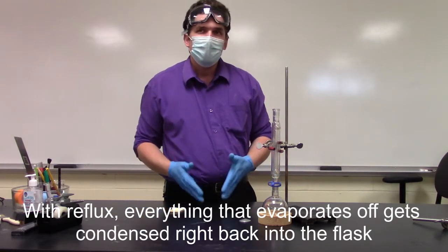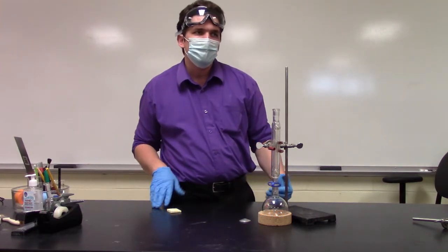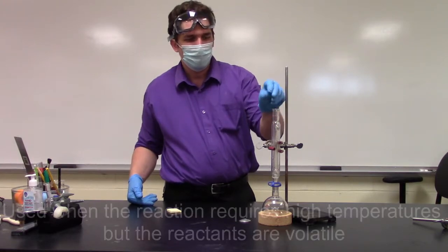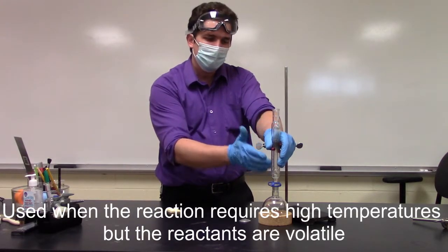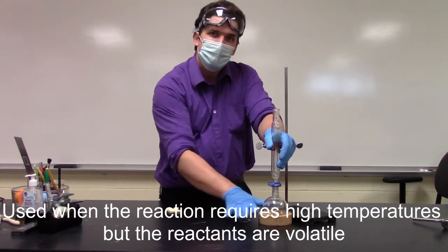So what happens is sometimes we have reactions that we need high temperatures to drive, but we have volatile compounds involved. So a reflux column would be set up something similar to this. Depending on how volatile your compound is, you may have more columns on top of it. But we would run cooling water through this single condenser column, and we would put it on top of our reaction flask, and we would heat the bottom of it.